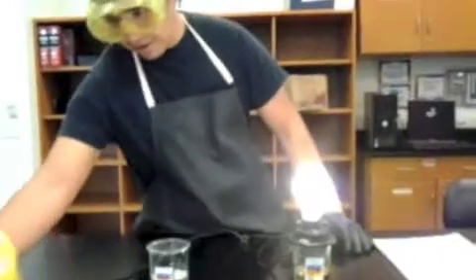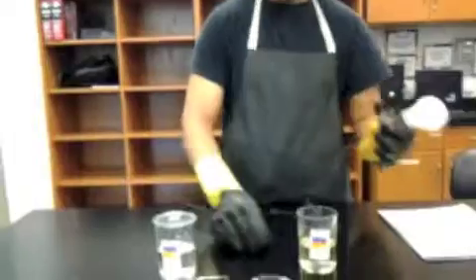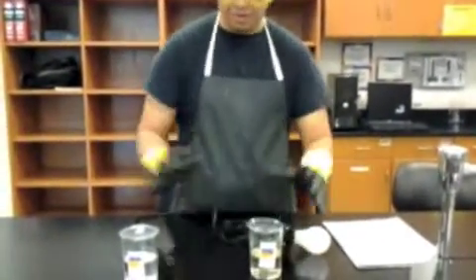Now to remove from the outlet and remove the light bulb. Remember to close it and safely place everything back where it was.